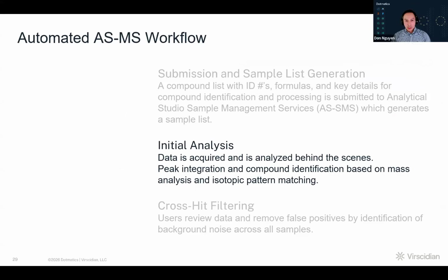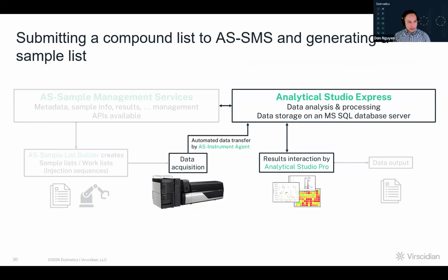Okay, so now we begin the data acquisition and the initial analysis. I don't have a mass spec in my living room, so I can't demo the data acquisition component. But again, once we detect data is being written to the instrument PC, we'll copy and transfer that over to Express. Initial data analysis and processing will take place behind the scenes. And what I can show you in the next few slides is interaction with the results, right?